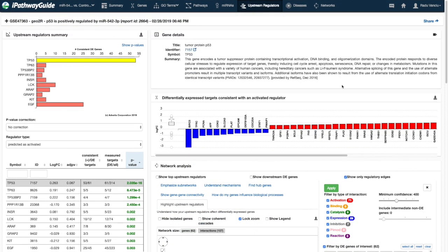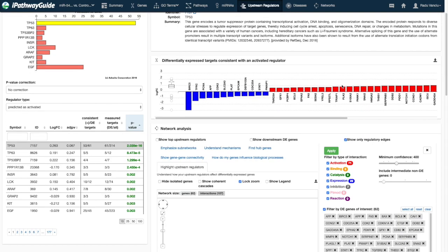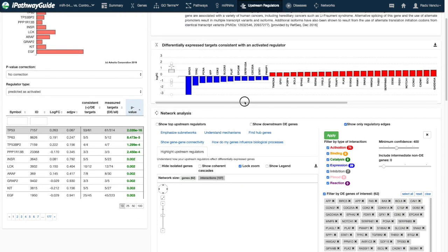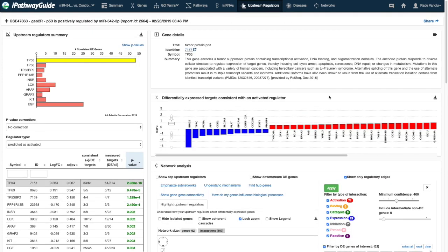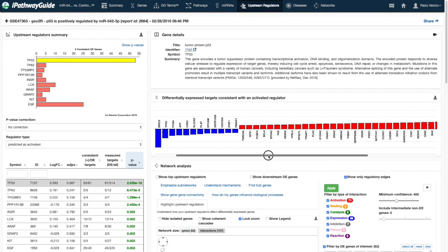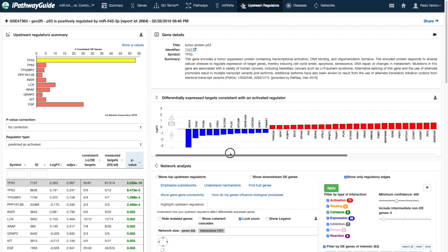In the Target Gene section, the list of consistent differentially expressed target genes for the selected regulator is displayed. These are the differentially expressed genes downstream of the selected regulator whose fold change is consistent with both the predicted type of regulator — activated or inhibited — and the type of interaction — positive or negative. These consistent DE target genes are listed in rank order from lowest fold change value to the highest fold change. You may need to scroll to see all the values.